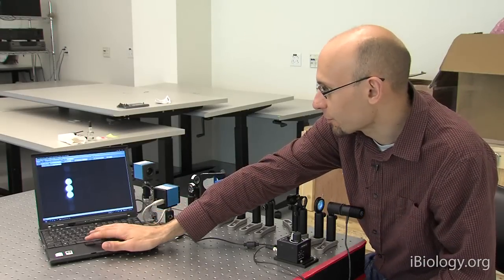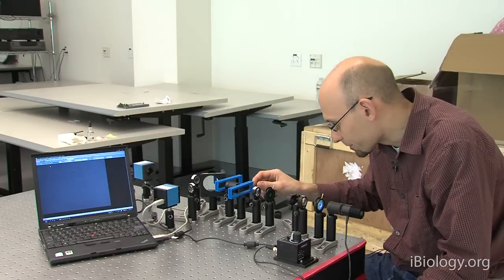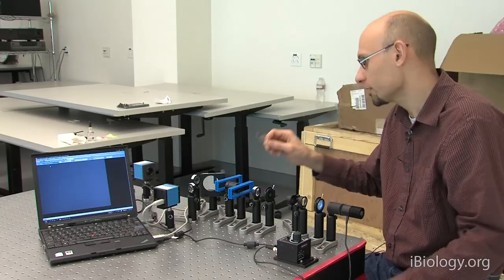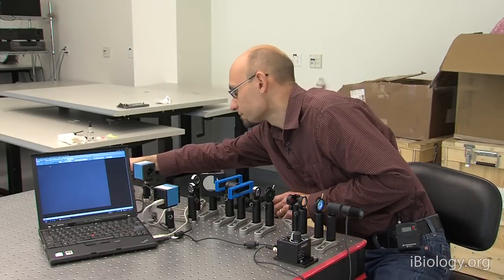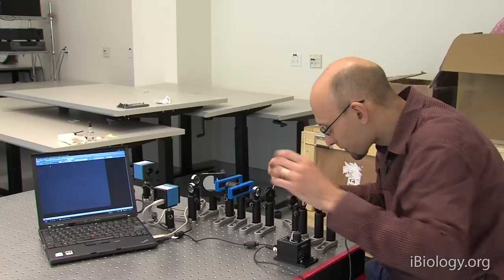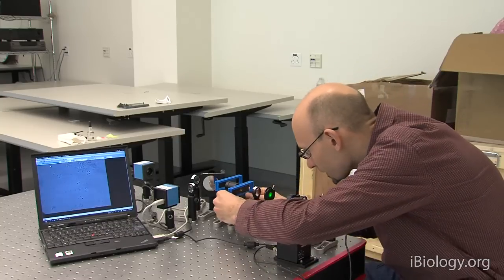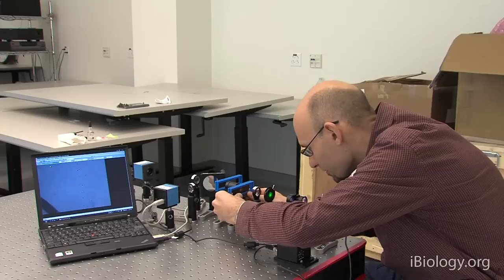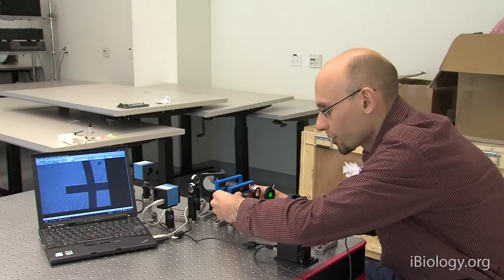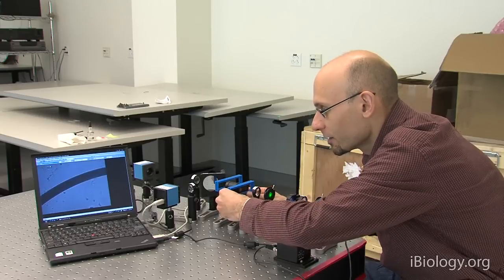So let's switch back to the image plane again, and now ask, what do we see if we put in a two-dimensional grating? So I'm going to switch slides now, take this guy out, and put this in. Our two-dimensional grating here is just an ordinary stage micrometer. This is just a grid with 10 micron lines that you would buy to focus your microscope, or to calibrate your microscope, rather.